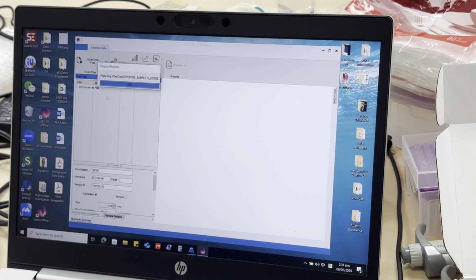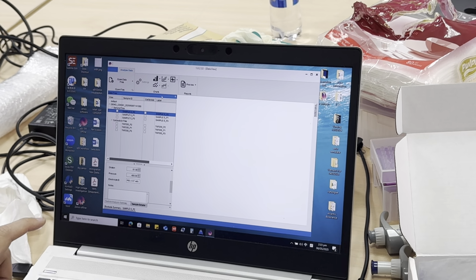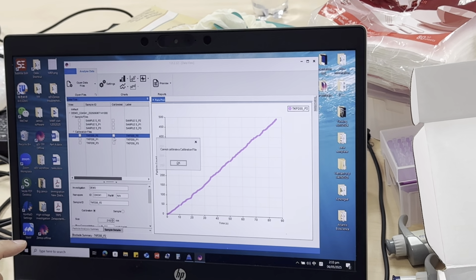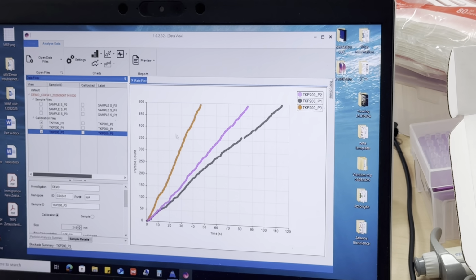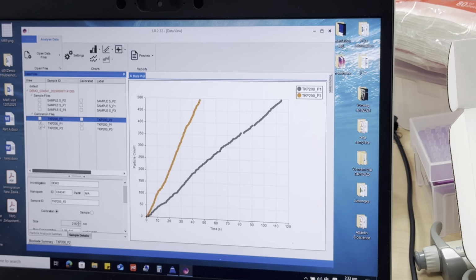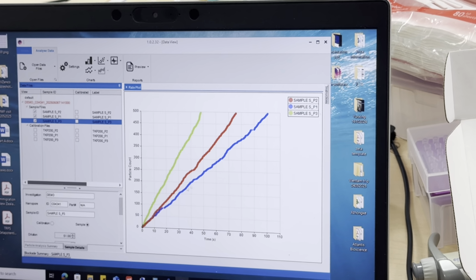But if, for example, a pharmaceutical company wants to see some samples or detailed data, first we need to check. Oh, sorry, cannot. With the increasing of the pressure, the flow rate should be higher. So it's another step of QC. After checking that one, we check the sample. It's also following the same trend.